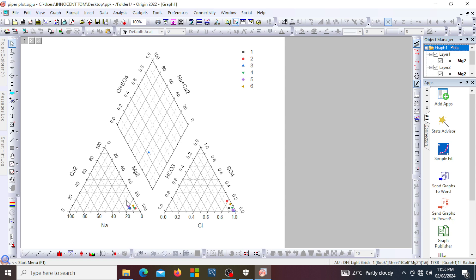So it is magnesium and sodium dominated on the cation side. When you come to the anion side, we see our data point falls more to the sulfate vertices, so it is sulfate dominated. The diamond-shaped field sums it all up.